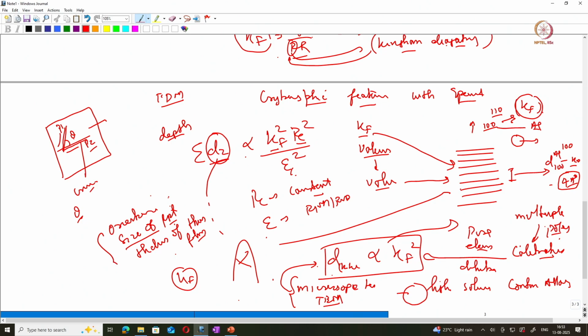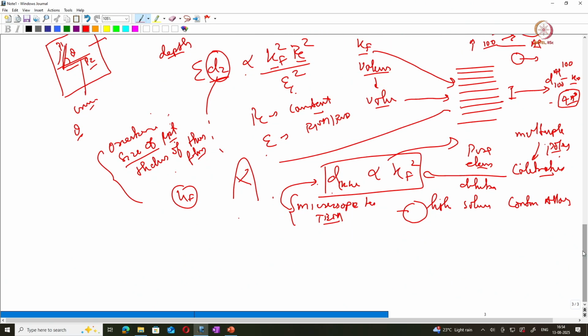Okay, so these features can be used to calibrate the KF value. We have just gone through the use of FIM and FDM for better calibration to get an optimum reconstruction which mimics the actual tip surface. I will also introduce the detector efficiency.